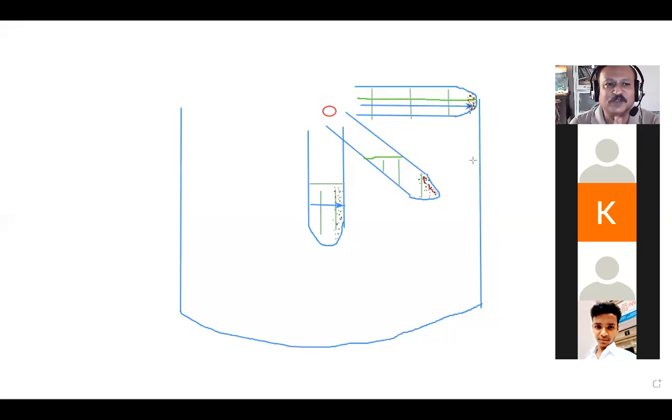See, it's not a question of what you have seen or what you have not seen. But can you imagine this situation? If the tubes are kept parallel to the ground, in a horizontal position, then is it possible to get maximum separation of the components? Theoretically, it is possible, isn't it? But practically, what could be the difficulty?